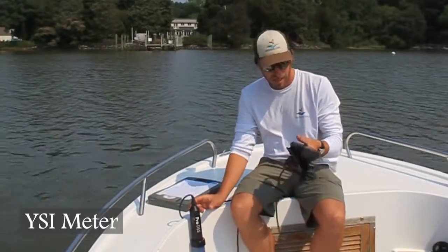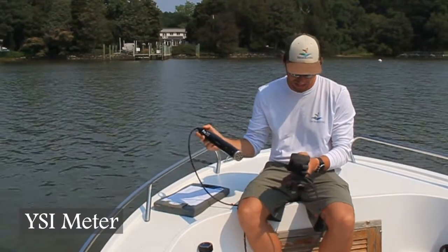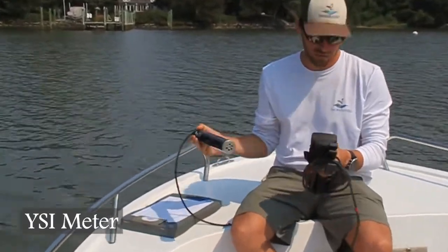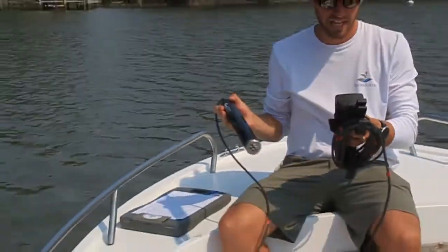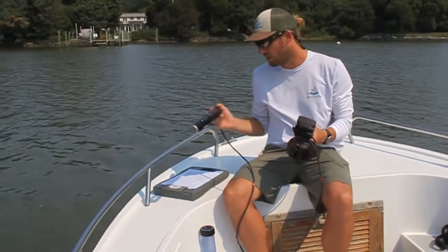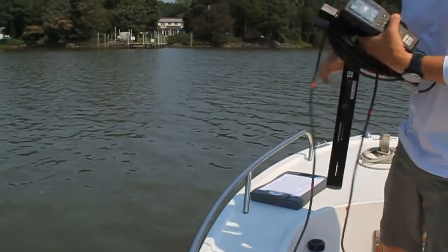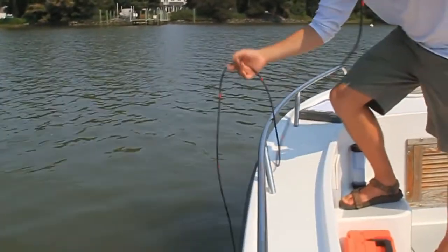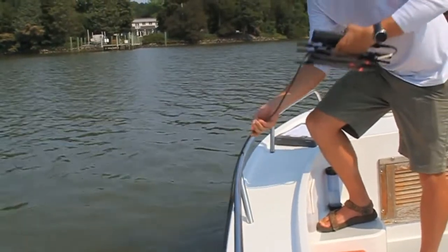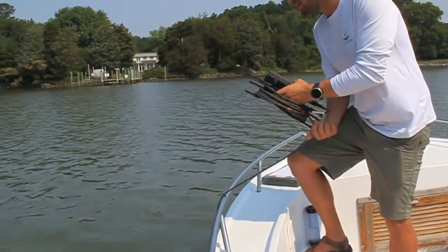Here I have my YSI meter, and this has a variety of different probes that are going to tell us information from the temperature of the water to the dissolved oxygen conditions, salinity, specific conductivity, and then the depth that we're reading this at. So what we'll do here is toss this in the water at the bottom of the water column so we can get the conditions that are occurring down near the bottom. So we'll lower it down, in this case to about 10 or 11 feet.